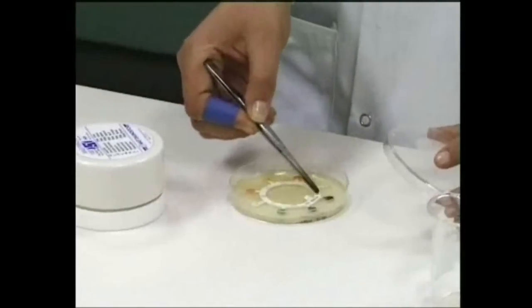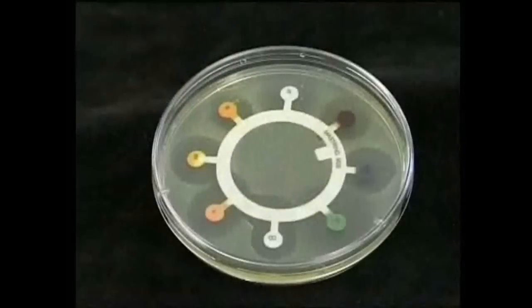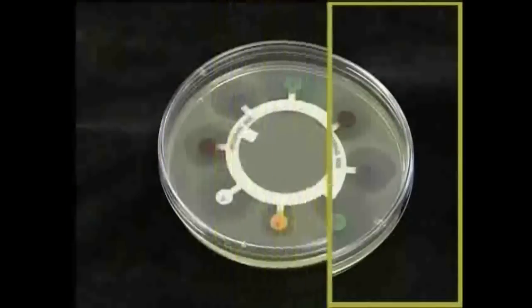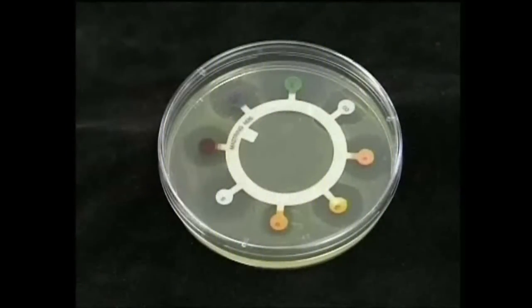Multi-discs can also be used to show inhibition of bacterial growth due to the presence of antibiotics. These are filter paper discs with a number of different antibiotics placed on spots around the edges of the discs. These are placed onto a bacterial lawn and again, inhibition by antibiotics is indicated by a clear zone. Multi-discs are useful as they allow the testing of more than one antibiotic for antimicrobial properties.